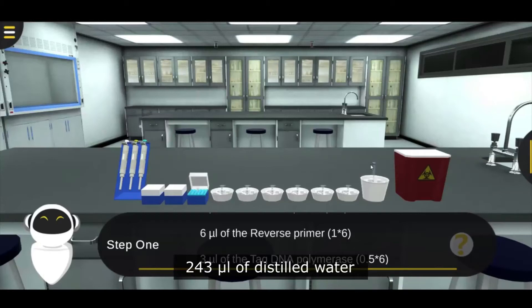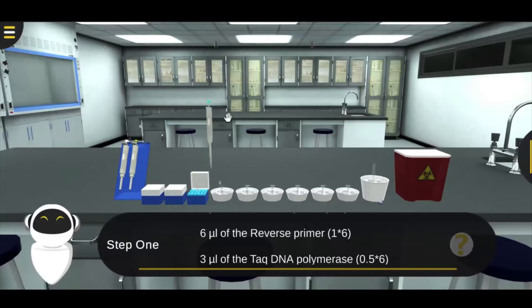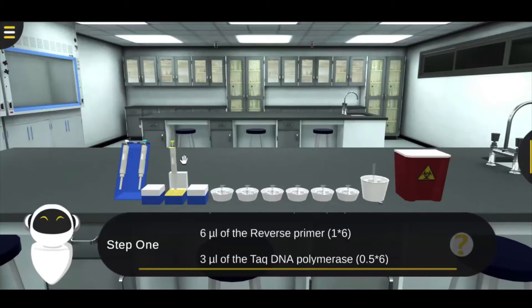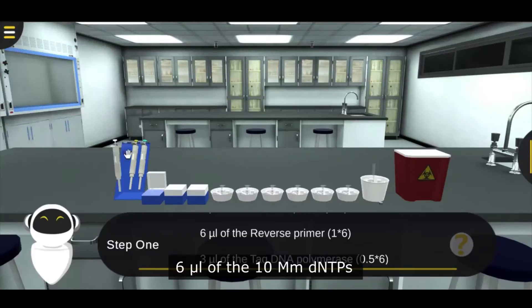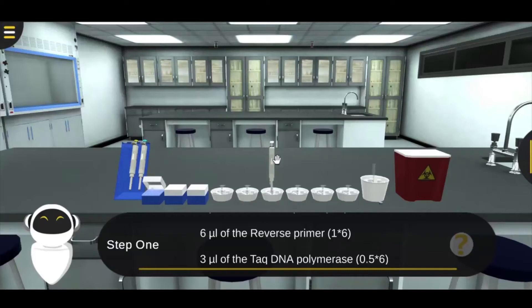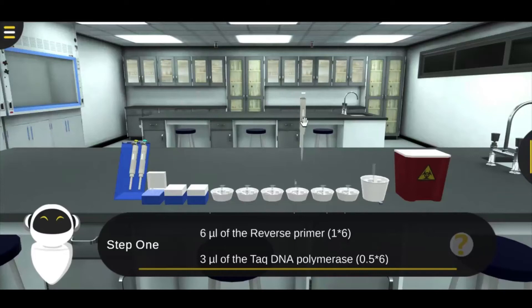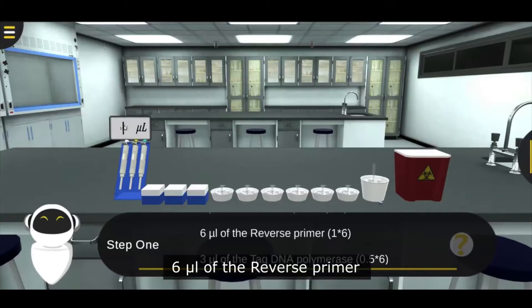Add 243 microliters of distilled water, 30 microliters of the 10X PCR buffer containing MgCl2, 6 microliters of the 10mM dNTPs, 6 microliters of the forward primer, and 6 microliters of the reverse primer.